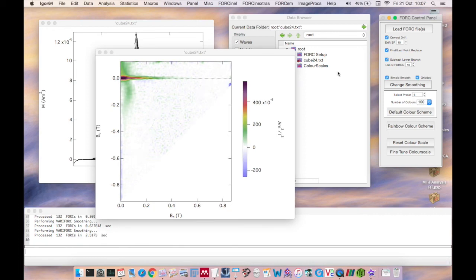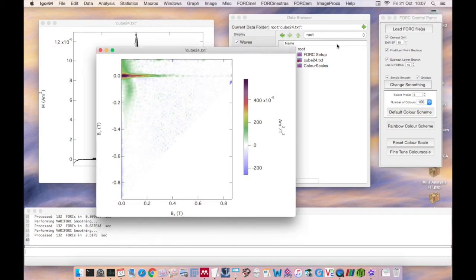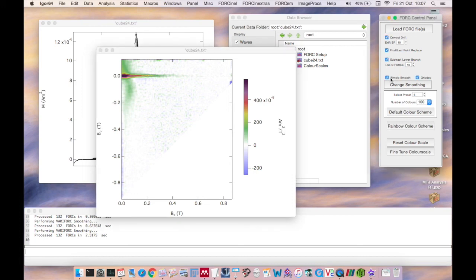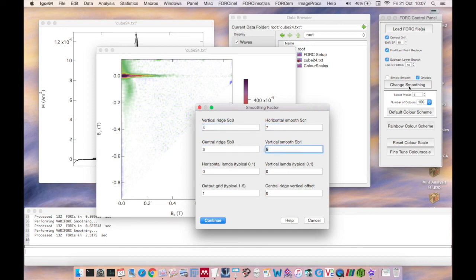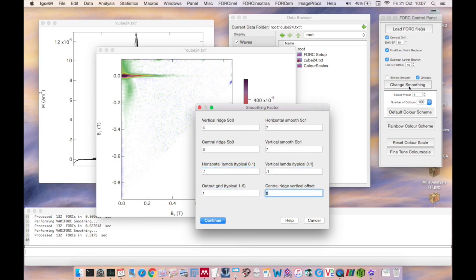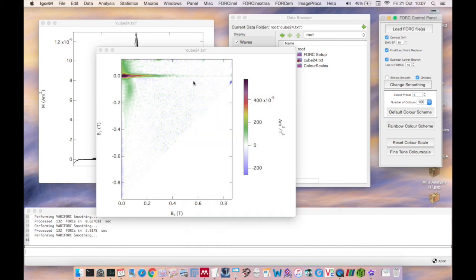If you prefer to process your data using the full varifork options then uncheck the simple smooth box and click the change smoothing button. Now you can enter your varifork smoothing parameters, an output grid factor and a new feature which allows you to specify a vertical offset for the central ridge of the fork. For most cases however this offset would be left at the default value of 0.